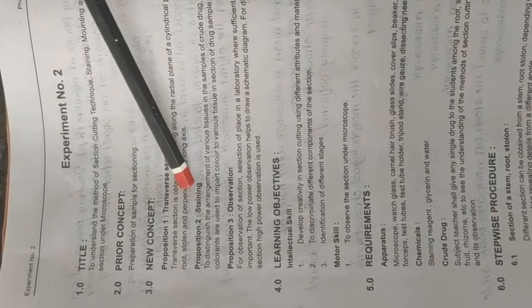Next is your staining, to distinguish the arrangement of various tissues in the samples of crude drug. You have to distinguish different types of tissue by using the staining reagent, that is chemicals, dyes or colorants, which are used to impart color to various tissues in the section of the drug sample.